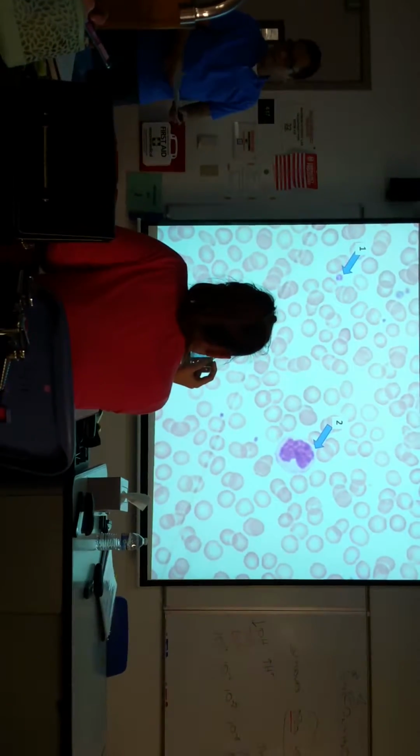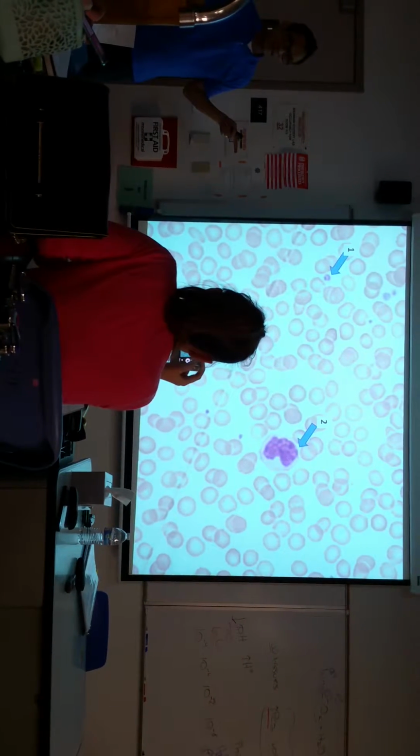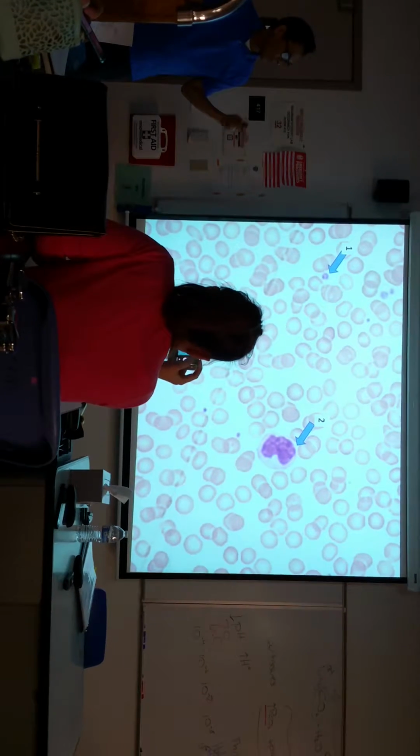Let's identify blood cells. Number 1, platelet. Number 2, any guesses? Kidney-shaped guy. Yeah, those are the monocytes.